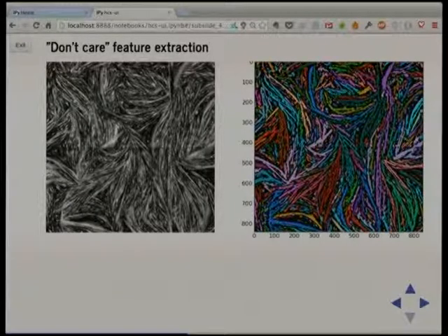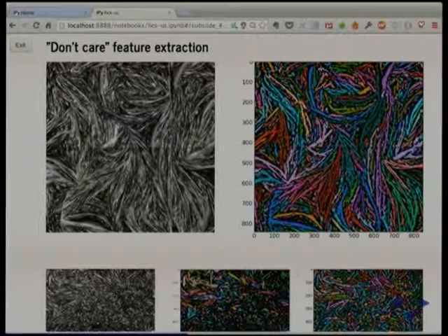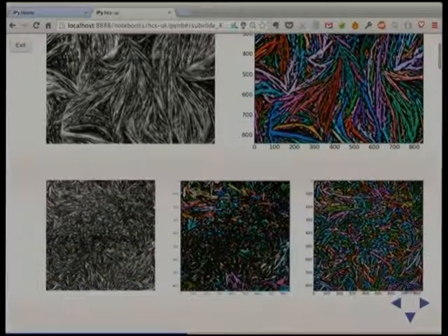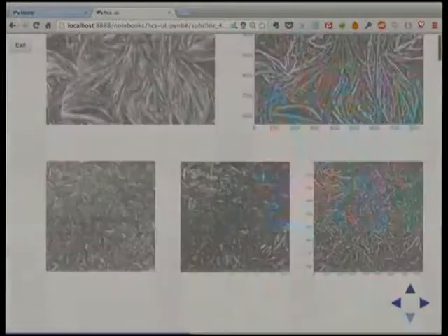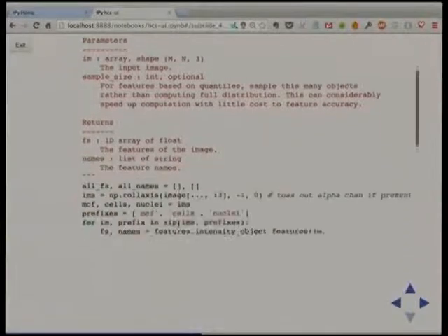And because the data had some illumination issues in some cases, so I'll scroll that. You can see here the center of the image is a bit less illuminated than the outside. I use two different thresholdings, and I measure the objects in both. And I just concatenate all the features together. So very, very simple. What are the features?